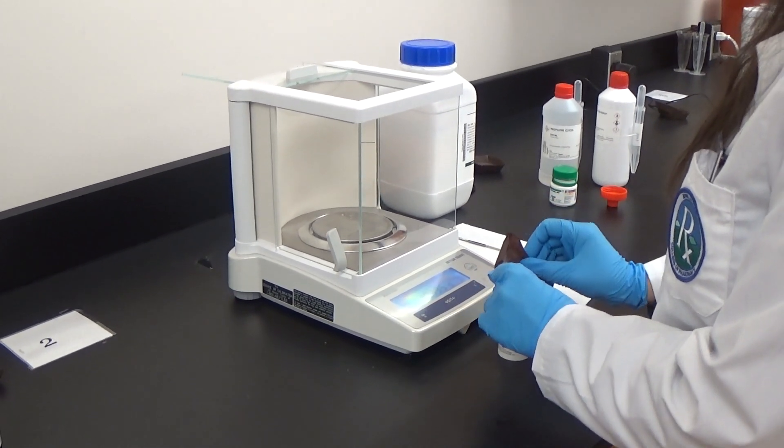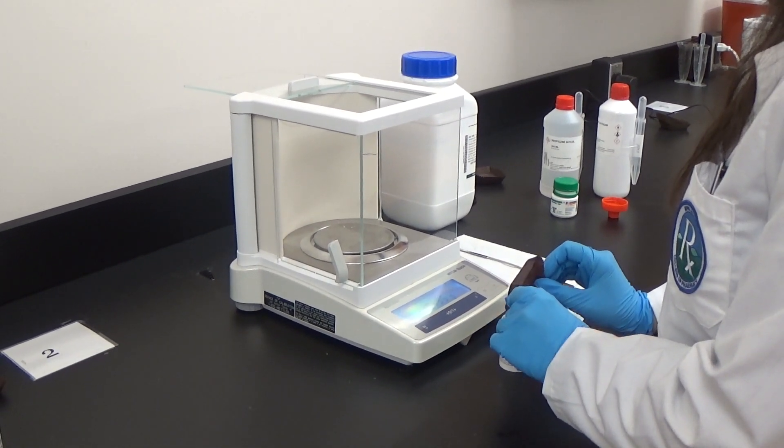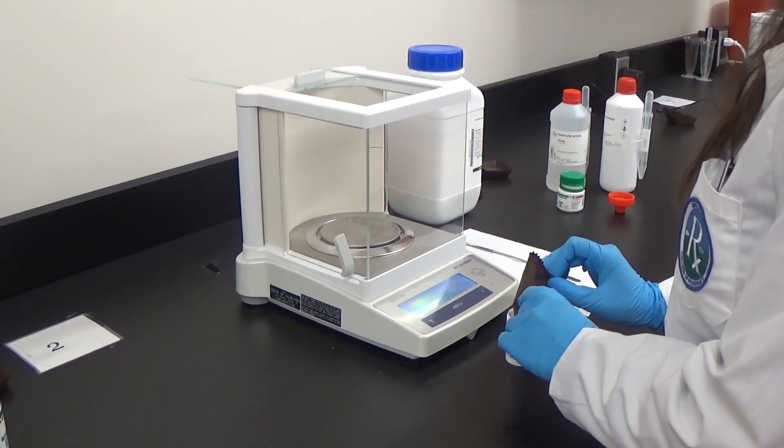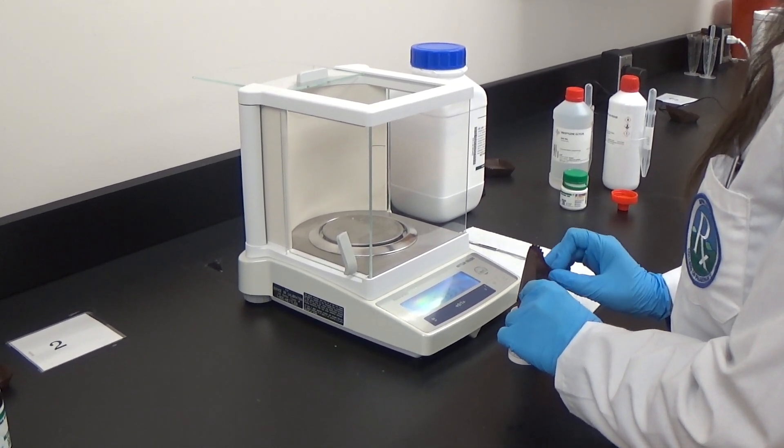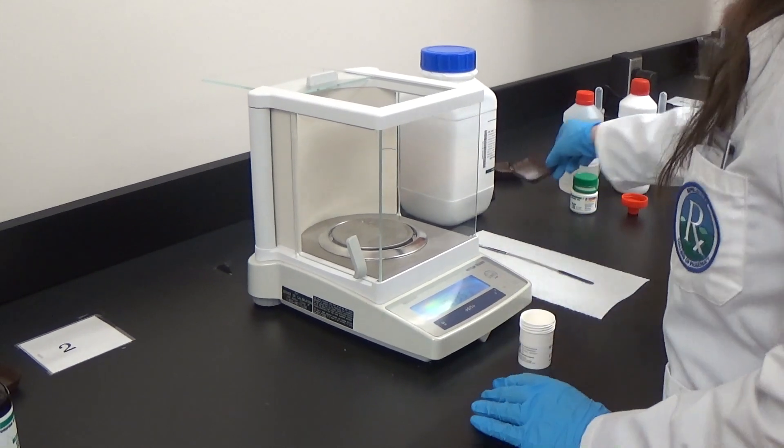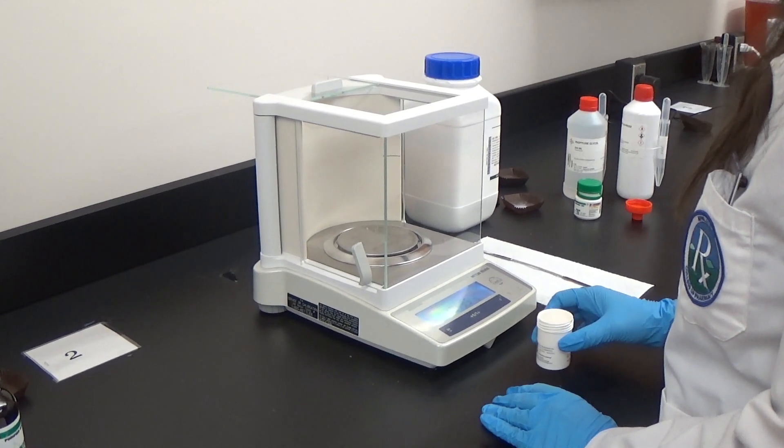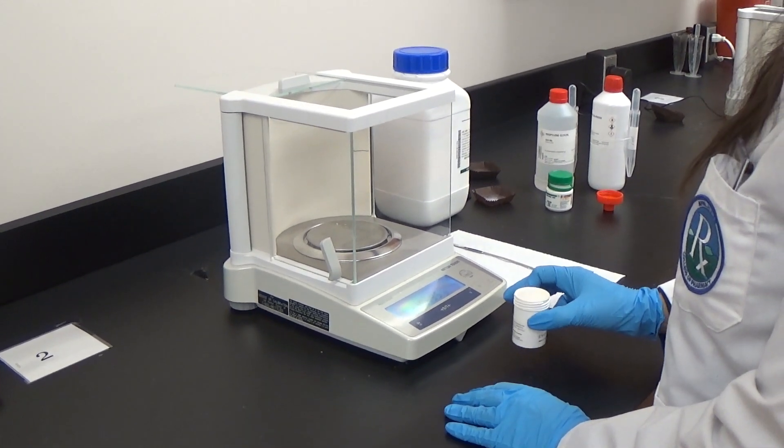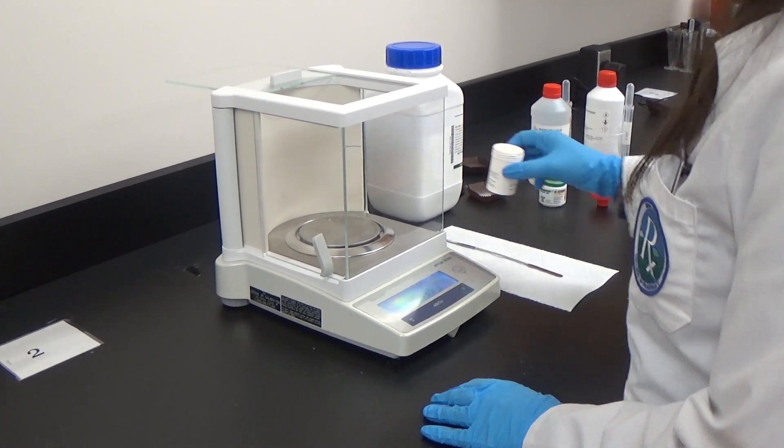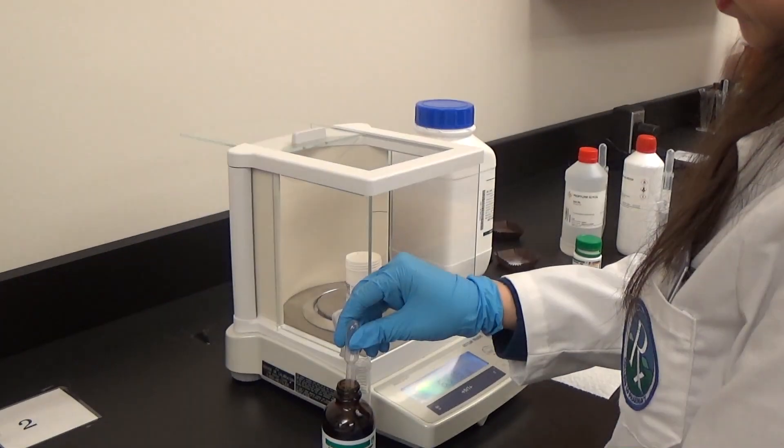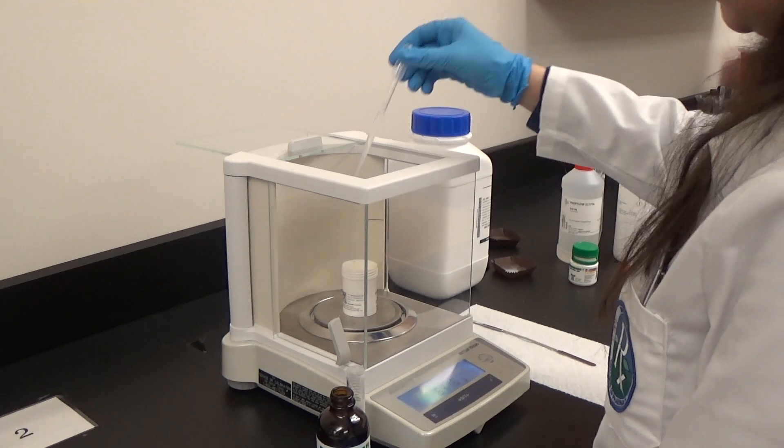Next, add carbomer 940 into the mix and swirl again for one minute. Finally, add sufficient water to the mixture to obtain the final weight.